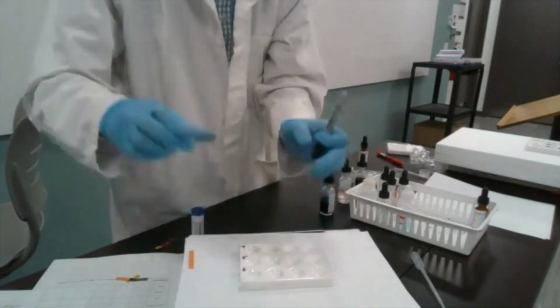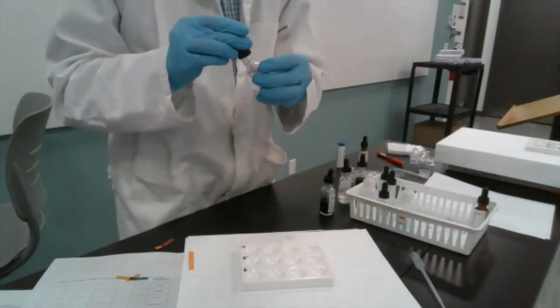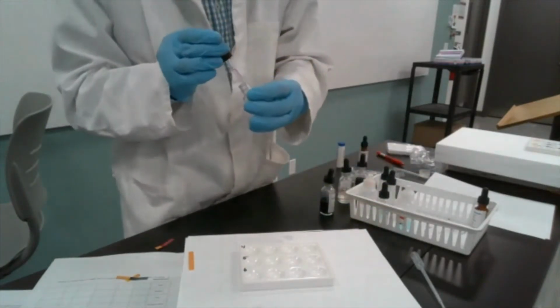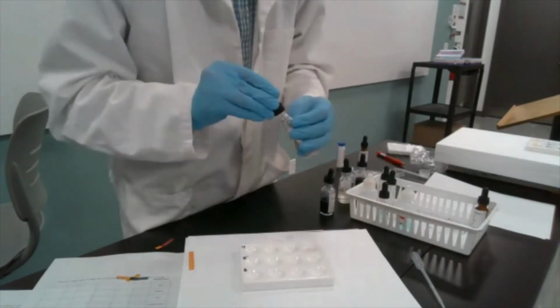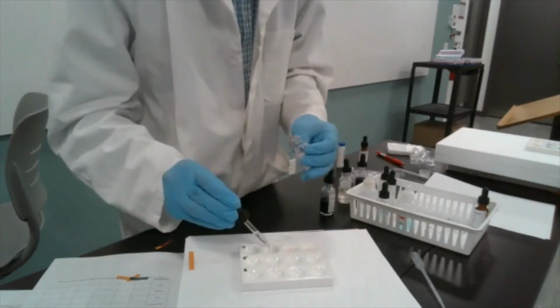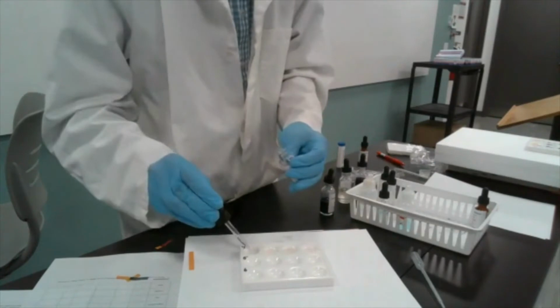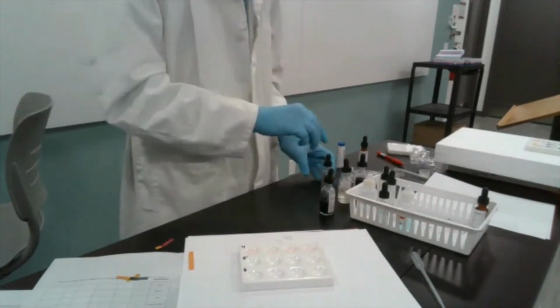I'm going to put it this way here. The grapefruit juice has a slight hint of pink to itself, but it's probably fine. It shouldn't affect our results too much. If anything, we can add some water and dilute it. Okay, so that was grapefruit juice.